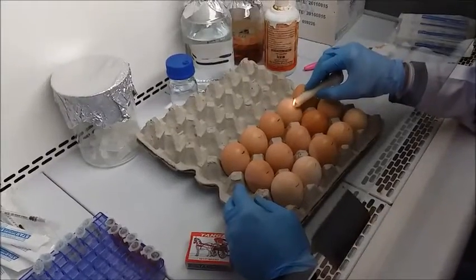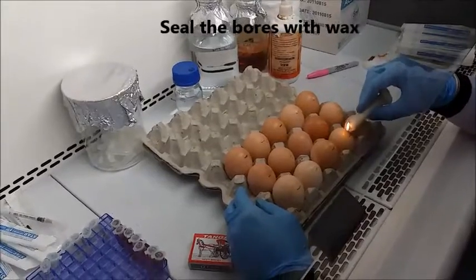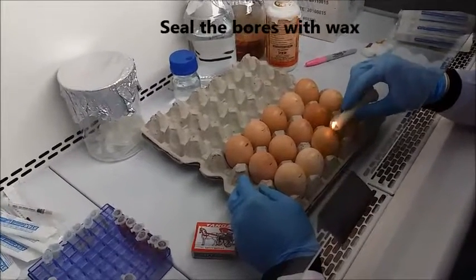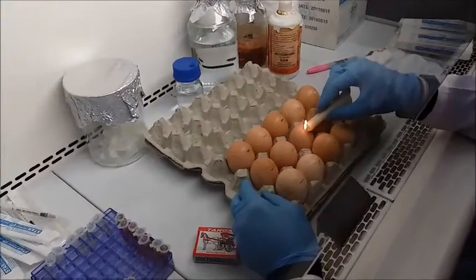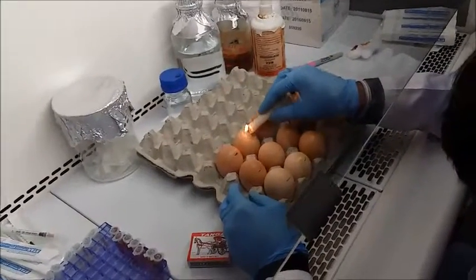Last thing you need to do is seal the holes that you made using wax or any other method that you know of. And after that, we can put these eggs into the incubator, and then we will proceed on to harvesting after 72 hours. And you're done.